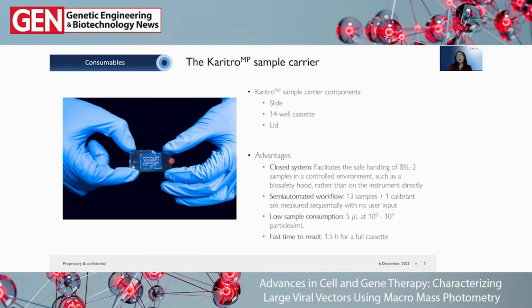Now, the reason why we designed it in this way is to prevent any cross-contamination or any additional risk for the operator, taking into account that usually these viral vector particles are BSL2 or CSL2, so present some sort of biohazard for the user. So in this way, we are reducing the exposure risk.